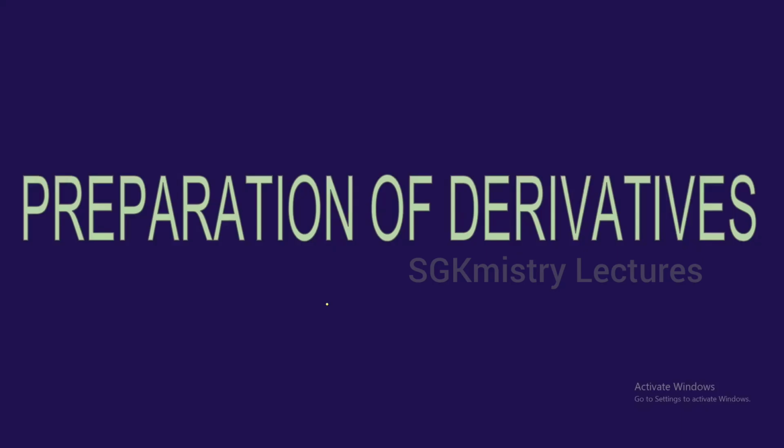And after that, we are finally coming to the preparation of the derivatives. So this is the final step that we need to conduct at the end of the organic analysis. Finally, along with the report you're giving, you need to prepare the derivative for that particular compound, and you have to give the sample of the derivative to the examiner in order to examine and award marks. Okay, so let us come to the last step of the organic analysis, that is preparation of the derivatives.